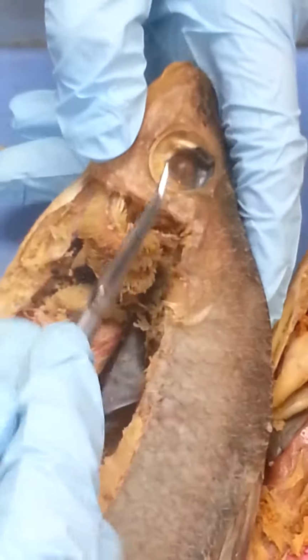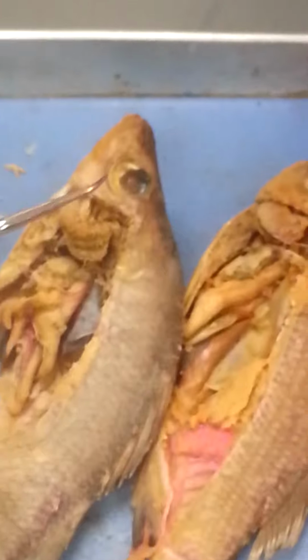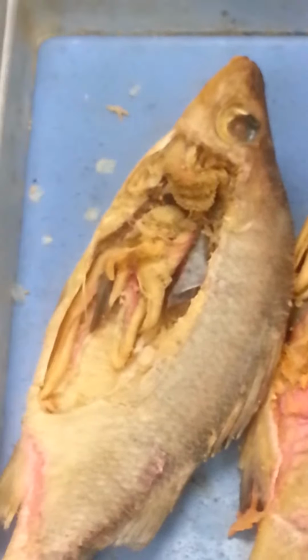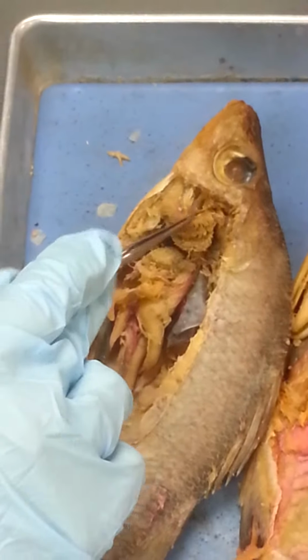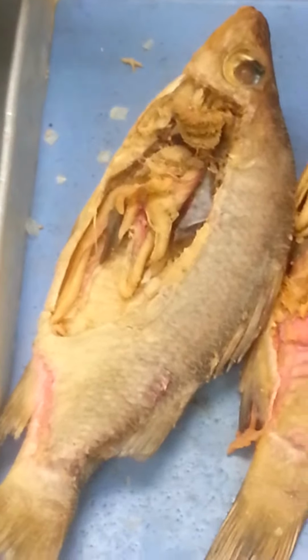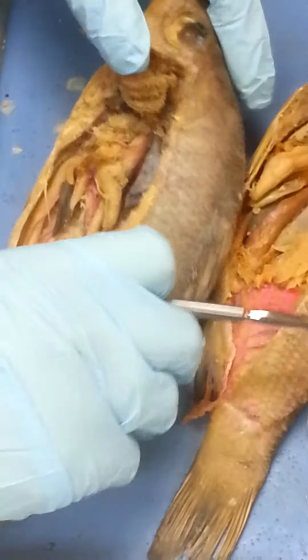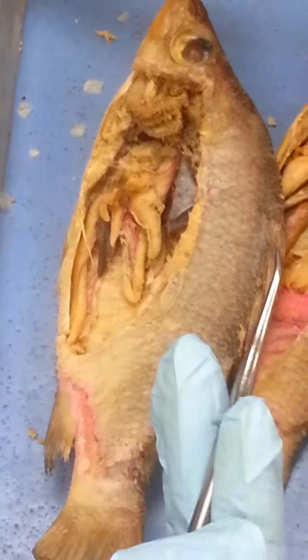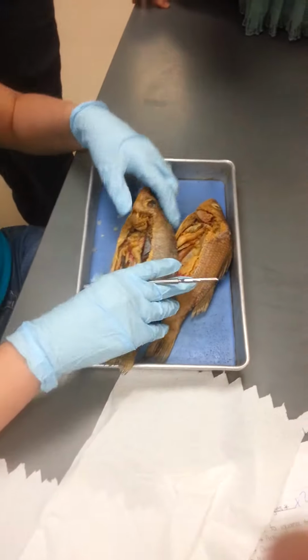And I won't have you ID those because they're small and they're not dyed red because, why? Not oxygenated. Yeah, they're not oxygenated yet because the point of oxygenation happens in the gills. So pretty much everything in the heart is all blood that's coming back from the body, and it's not oxygenated until it gets to the gills. Okay? So unlike ours, the oxygenated blood doesn't come back to the heart to be pumped to the rest of the body.